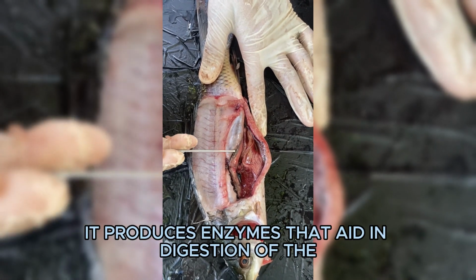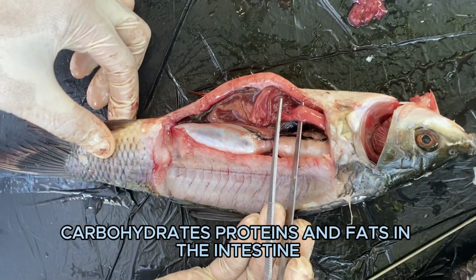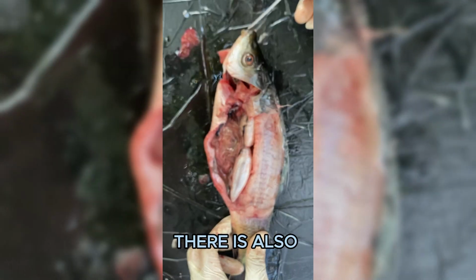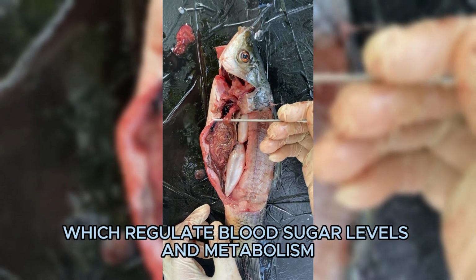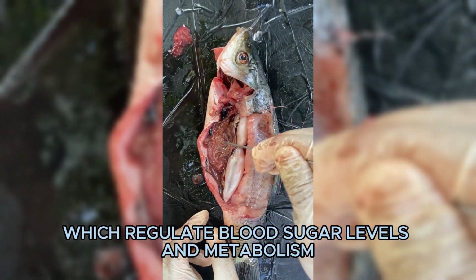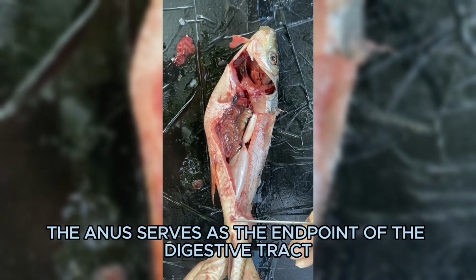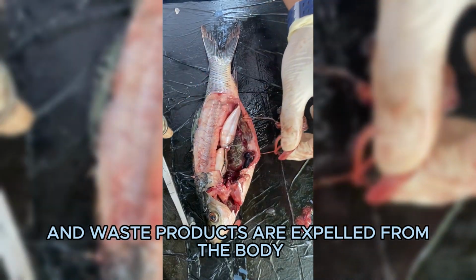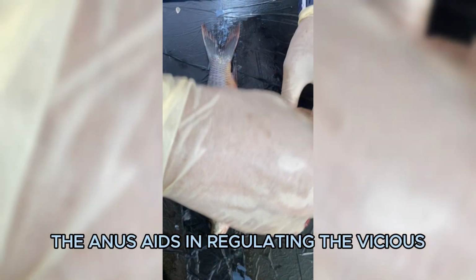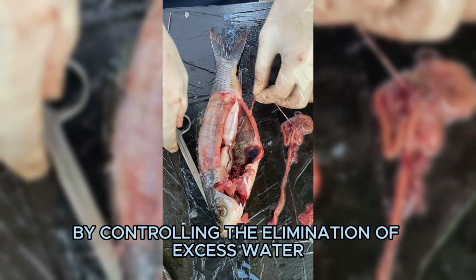Pancreas. It produces enzymes that aid in digestion of the carbohydrates, proteins, and fats in the intestine. It also secretes hormones such as insulin and glucagon, which regulate blood sugar levels and metabolism, ensuring the fish's energy balance and overall health. The anus serves as the endpoint of the digestive tract, where undigested food and waste products are expelled from the body. The anus aids in regulating the fish's internal environment by controlling the elimination of excess water and maintaining osmotic balance.